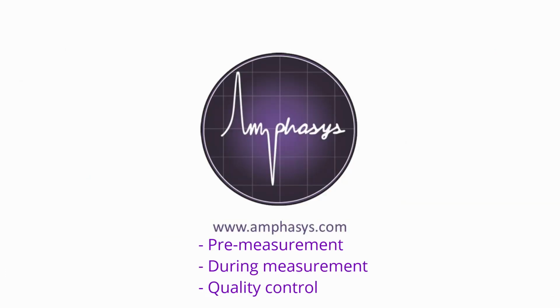Please note that the necessary connection between computer and instrument, as well as the rinsing of the fluidic system, have already been completed in my setup here. For a better overview, we split up the video content into three phases, which are pre-measurement, during measurement, and quality control.